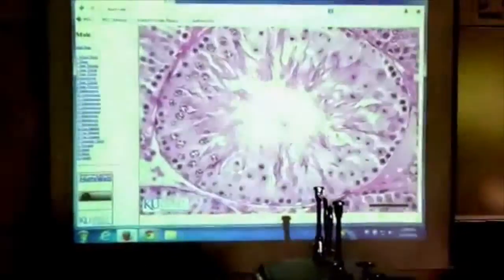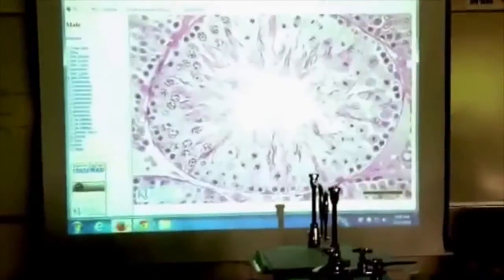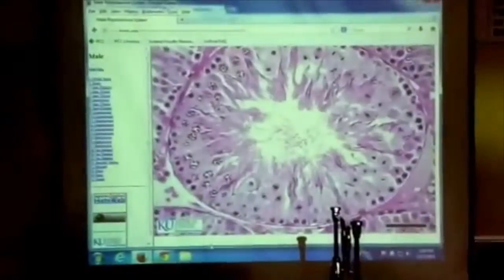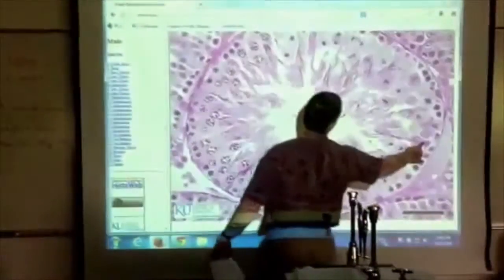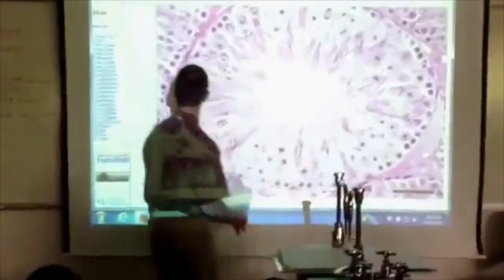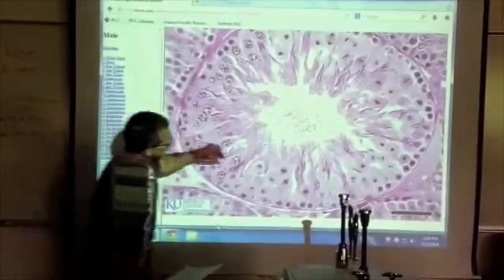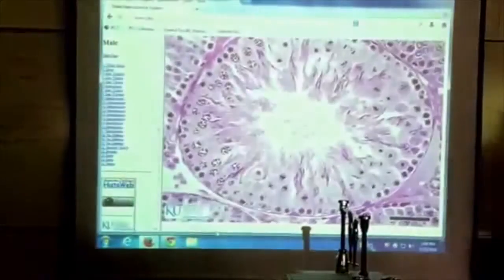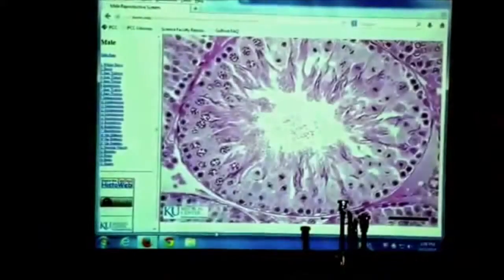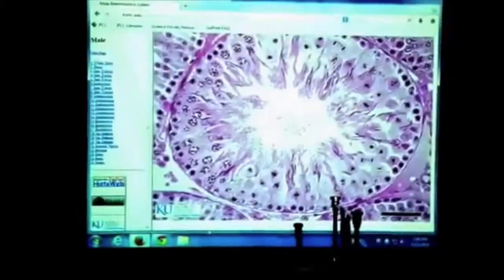Because now everything changes. Can I ask a quick question about that slide? Sure. So, was there an obvious sustentacular? Max, or Josh, can you let those shades down, please? That one. Thanks. I'm going to go with those two. Sustentacular, Sertoli, sustentacular, Sertoli. Okay, those two. They just look odd. Usually they're pointy and triangular. We're going to zoom in.